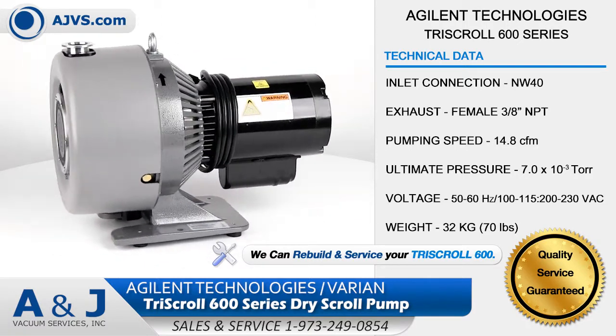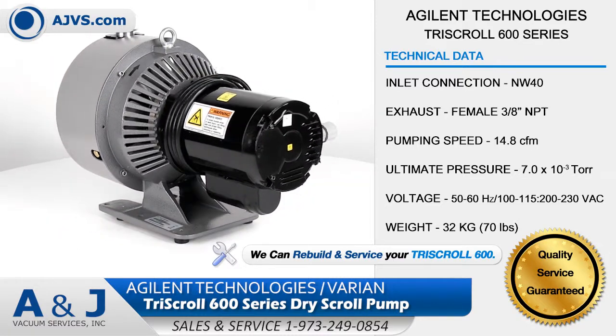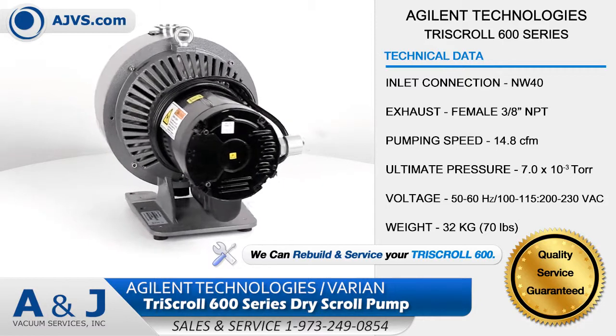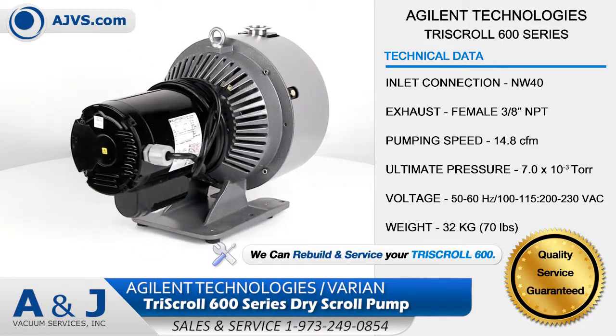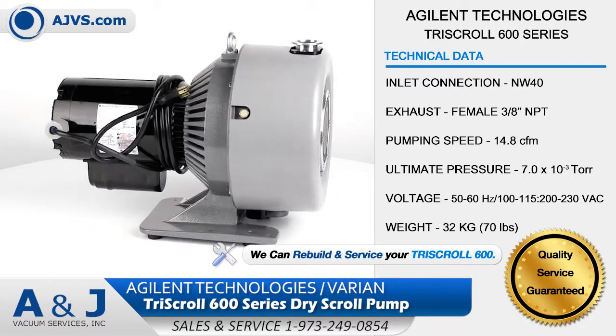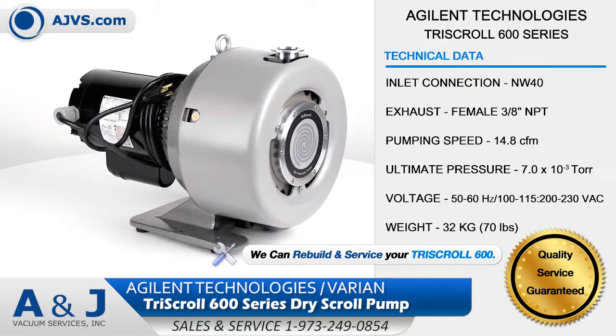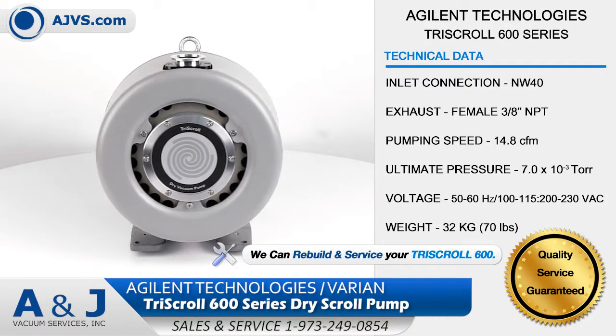The Tri-Scroll 600 operates at high pumping speeds of up to 500 liters per minute while maintaining low ultimate pressure. The unique patented features of the Tri-Scroll series include long-life tip seals, bearing purge ports, and automatic gas ballasts.